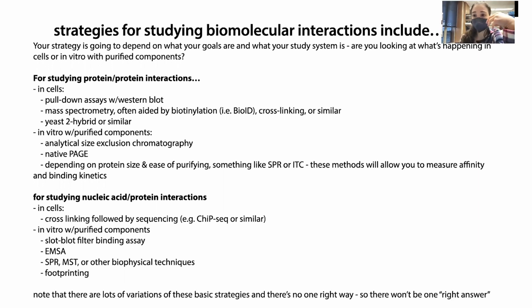And sometimes there could be extra components that are missing in vitro, and so things might not behave quite the same in vivo. So you can address these questions in your in vitro system and then test their importance, to see if your hypotheses make sense in the larger context of the actual cellular environment.